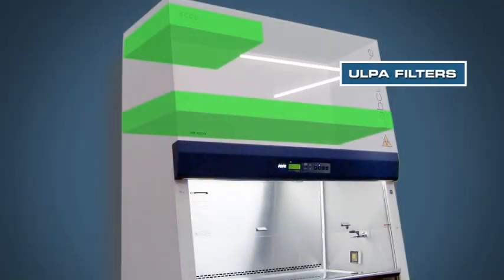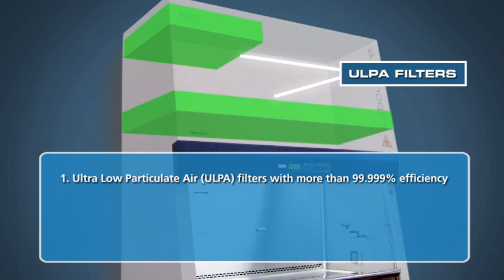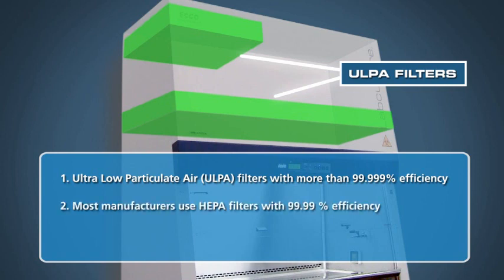The LabCulture Class II Type A2 Biosafety Cabinet uses the latest design in ultra-low particulate air, or ULPA, filters with a typical efficiency of more than 99.999% for particulate sizes of 0.12 microns to 0.3 microns. ULPA filters are able to provide 10 times better filtration as compared to conventional HEPA filters offered by other manufacturers.